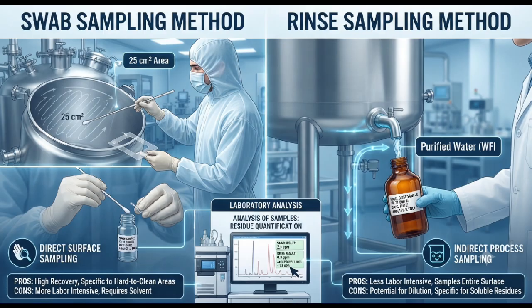Rinse sampling. Rinse sampling is performed by collecting the final rinse solution after cleaning. This method is especially useful for equipment with complex internal surfaces where swabbing is difficult. Although rinse sampling evaluates the entire system, it cannot identify the exact location of any remaining residue. Therefore, many facilities use both swab and rinse sampling together.